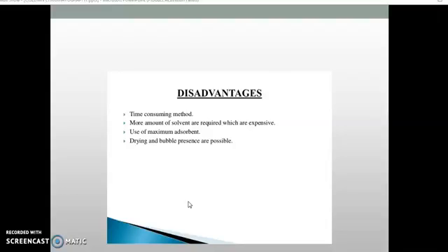Now, for maximum adsorption, you need to try the slurry form, gel form, or adsorption stationary phase prepared. You have to pour the entire stationary phase into the column and let it settle down, and later on you start your practical. After this, enter the solvent as a mobile phase through the system. It needs to stay wet, and bubbles should not be present. These are all the precautions needed in column chromatography.